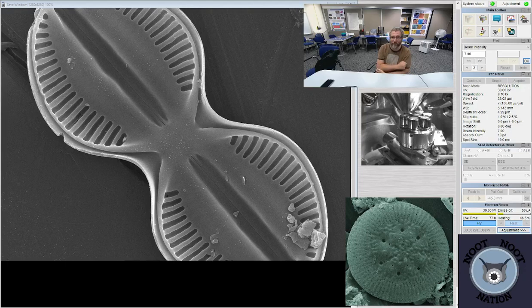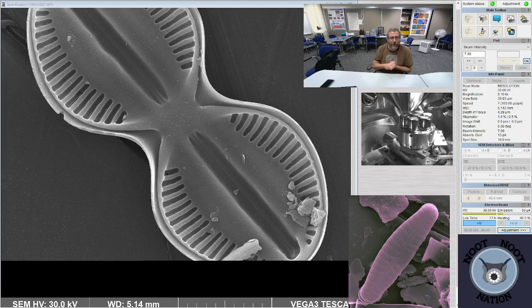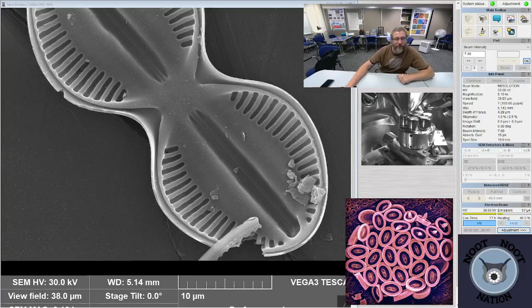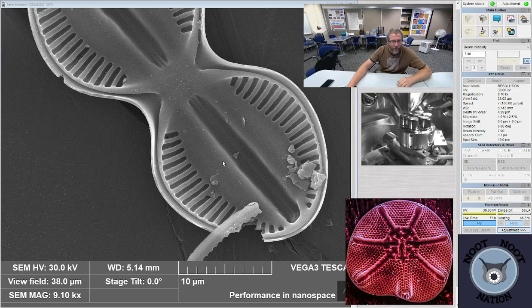Their skeleton, which is what we're looking at, is rigid. It's an exoskeleton, basically, an external skeleton. And so the skeleton doesn't divide. It's always rigid. It's always the same shape. So this is half of a diatom. It's a Diploneis. And a lot of the Diploneis in the marine realm have this sort of peanut shape, like a multi-lobe or bilobate shape. The Diploneis that are found in the marine realm more typically, I should say, have that shape.